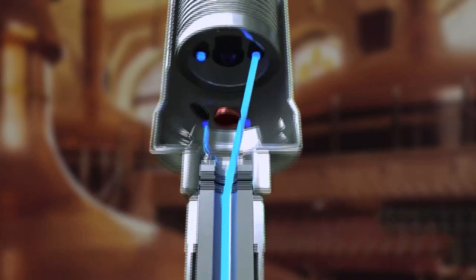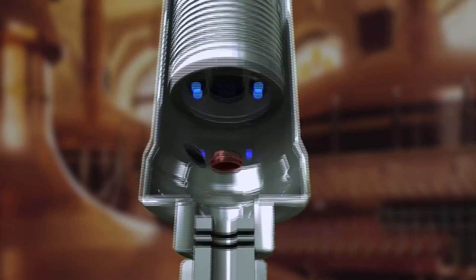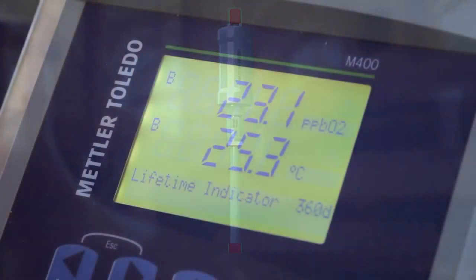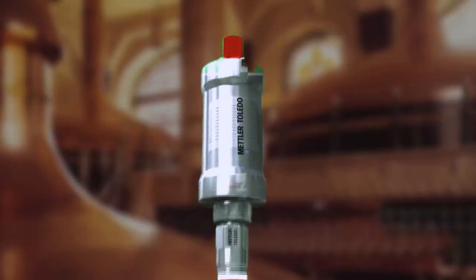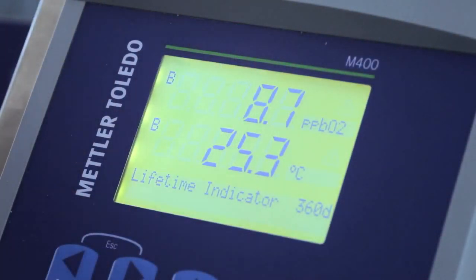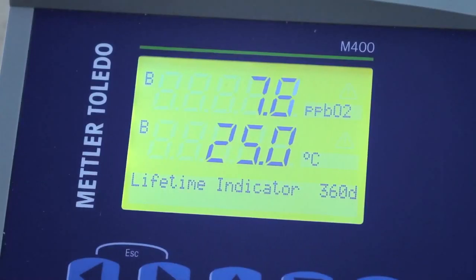The Impro 6970i scores highly in all these areas. The sensor's stainless steel body is extremely robust, the unit is easily and quickly installed, and the only maintenance required is the periodic exchange of the oxygen-sensitive element, the opto cap.